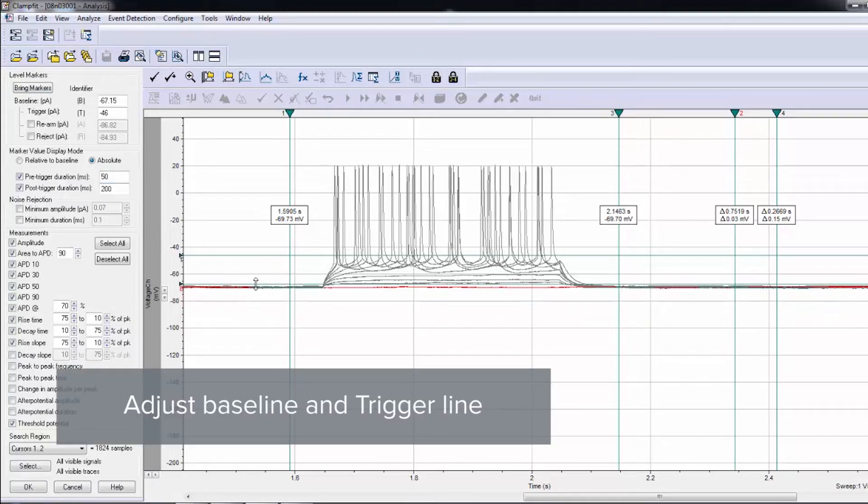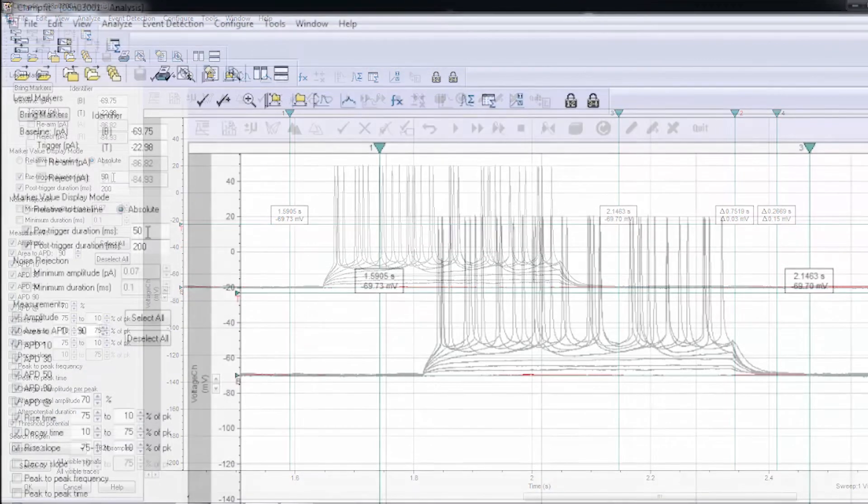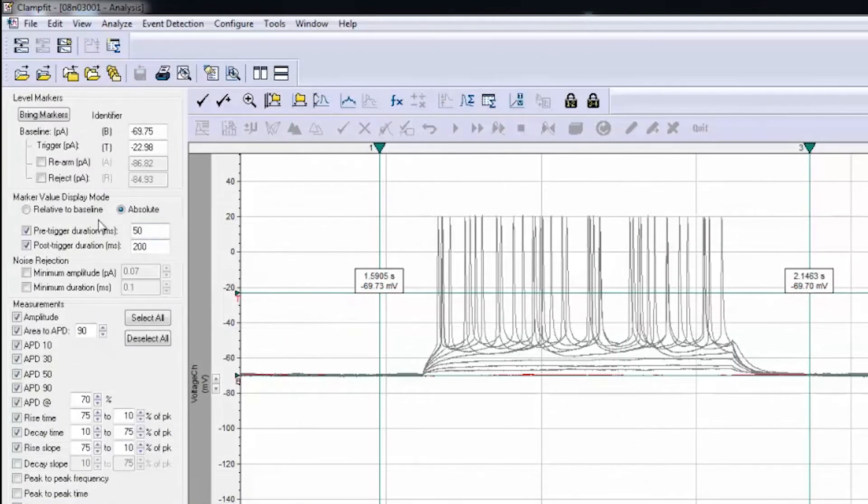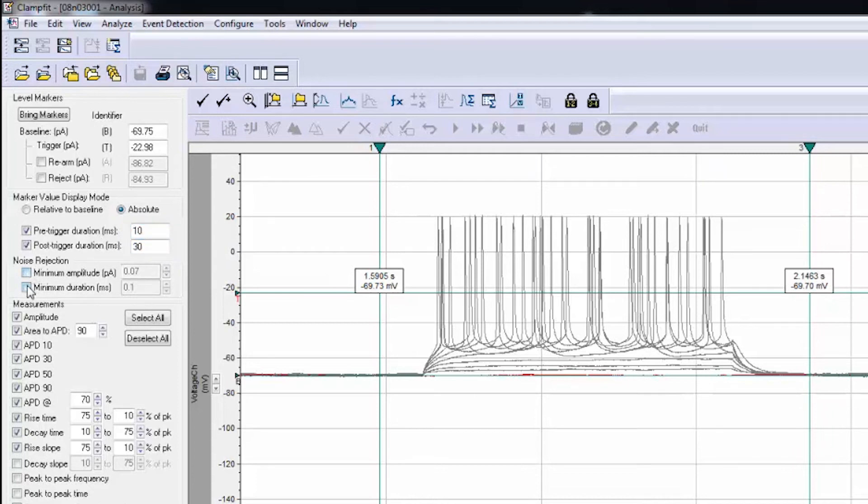Adjust the baseline and the trigger line. Select either Relative to Baseline or Absolute for Marker Value Display Mode. Set Pre-Trigger and Post-Trigger Duration. Set Noise Rejection if needed.